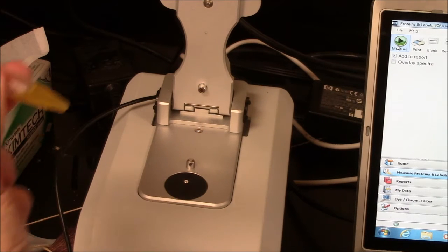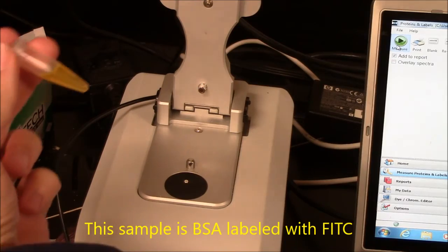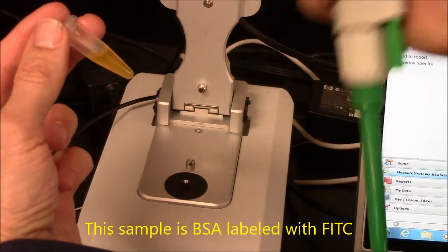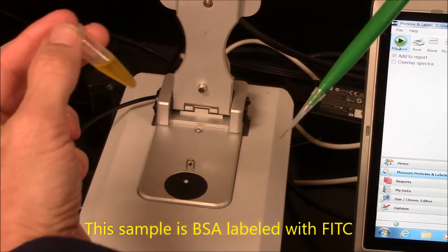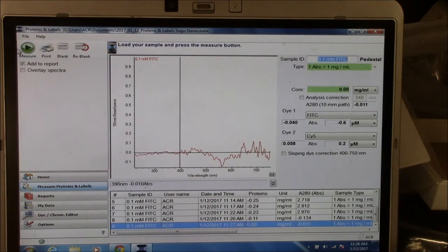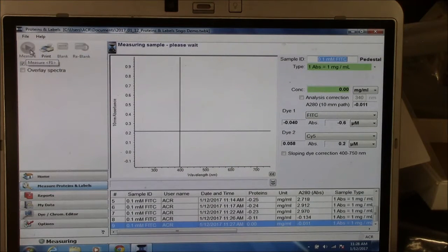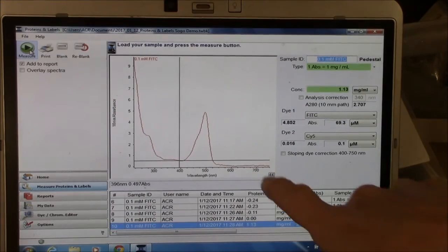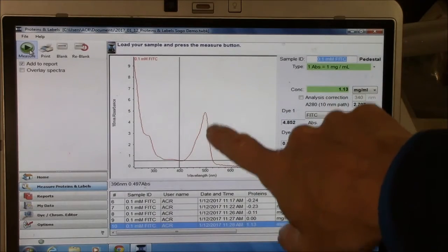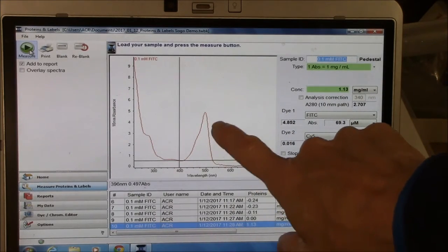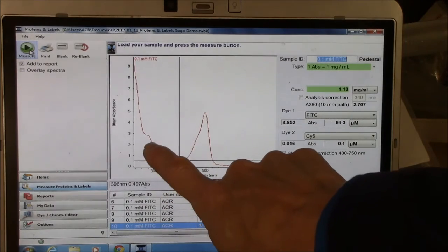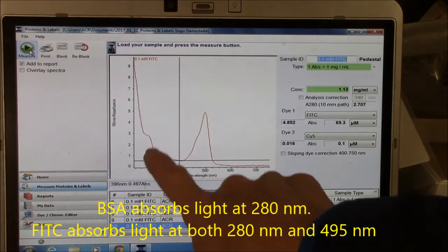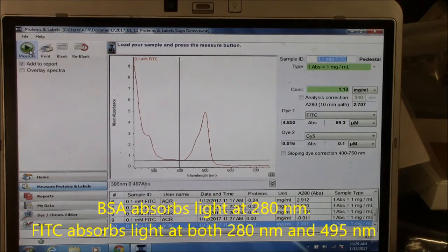Now, I've got a fraction here of labeled protein, so it's labeled with FITC. I'm going to take the spectrum of that. I've loaded the labeled protein. I'll press measure. And I get a spectrum that has this peak here due to the dye, the fluorescein, and it has a peak here that's due to protein and dye.